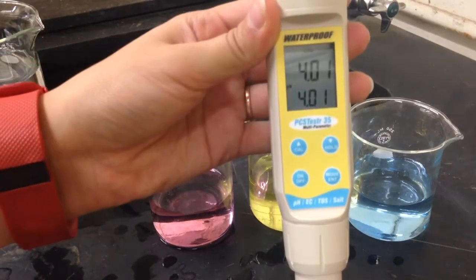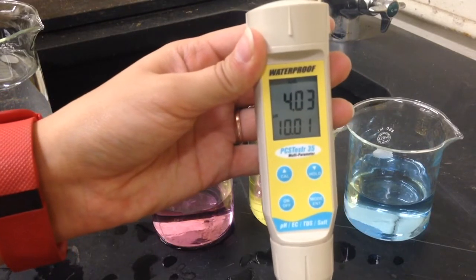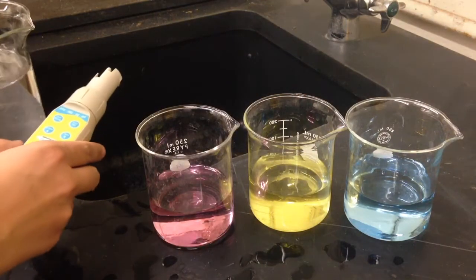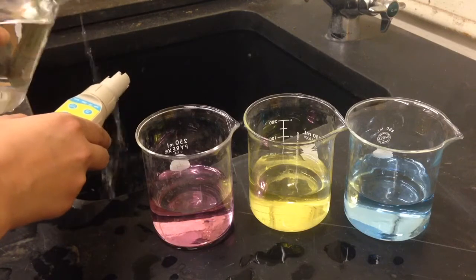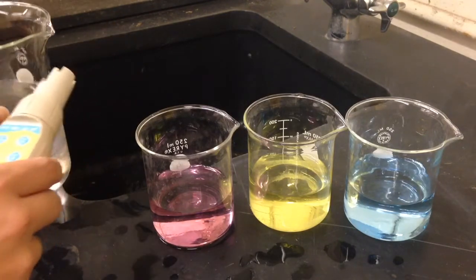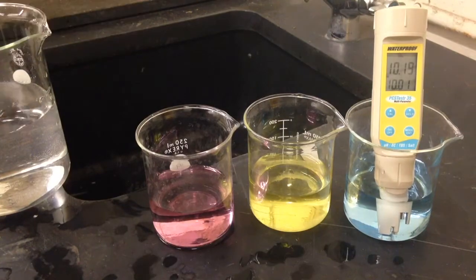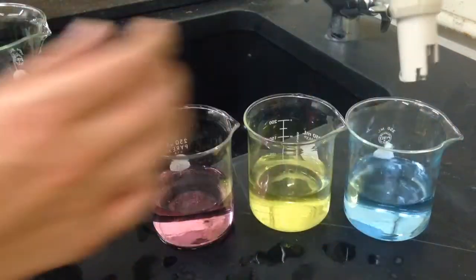Again, the primary display will flash, and the secondary display will read the other calibration standards we can use to calibrate our meter. Before using the last standard, we are going to rinse our meter. After rinsing, we will immerse it in the final calibration standard and wait for the primary display to stabilize. When it has stabilized, we will push the mode enter button.